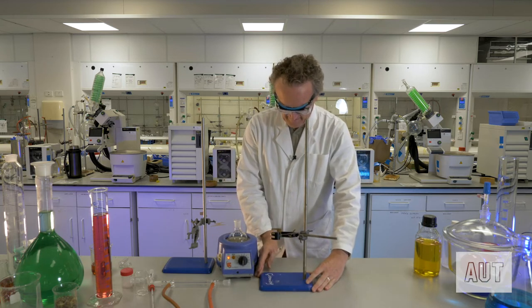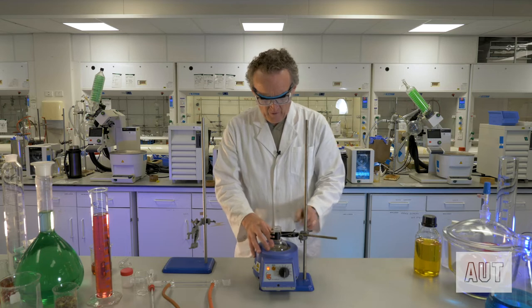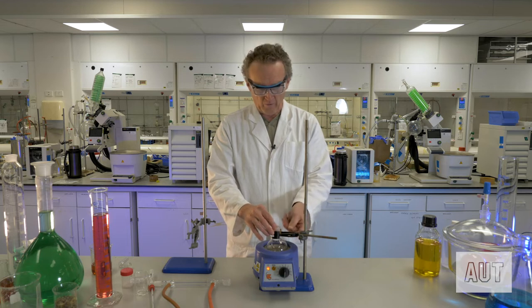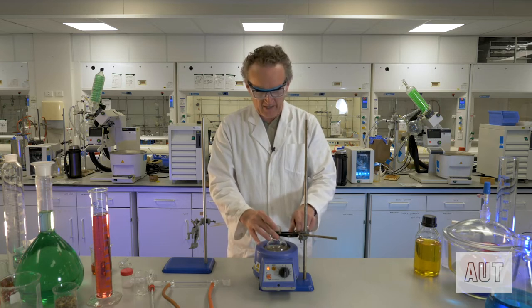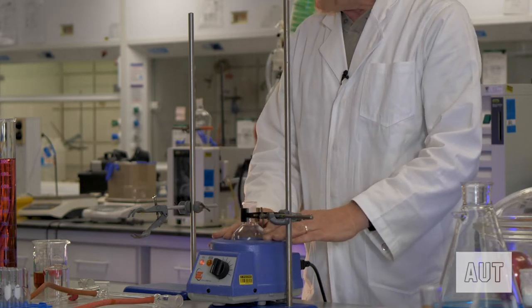Right, so it's really important that you clamp in the correct places because the clamps are going to hold the whole arrangement together. If you do put them in the wrong places, it could easily fall apart. You'll end up breaking your quick fit glassware and your instructor will not be happy with you, okay? So that's clamped nice and firmly there. We have our round bottom flask there.